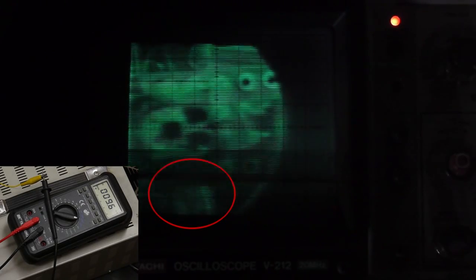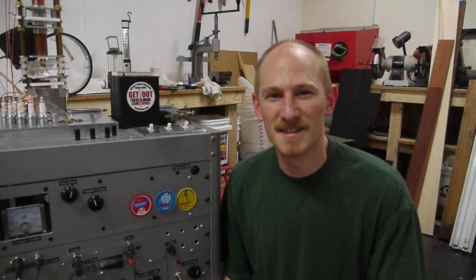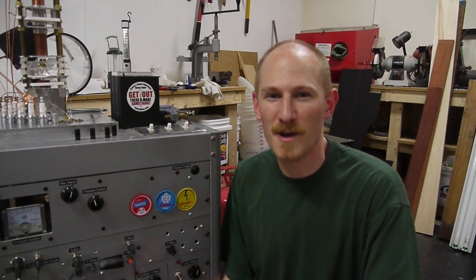I can see electricity. Hey everyone, here's an experiment I've wanted to try for a while.